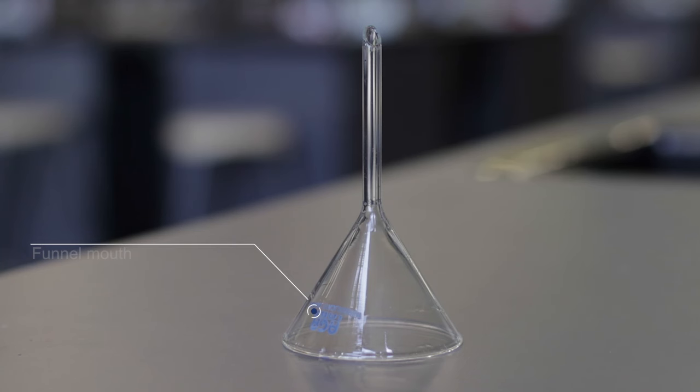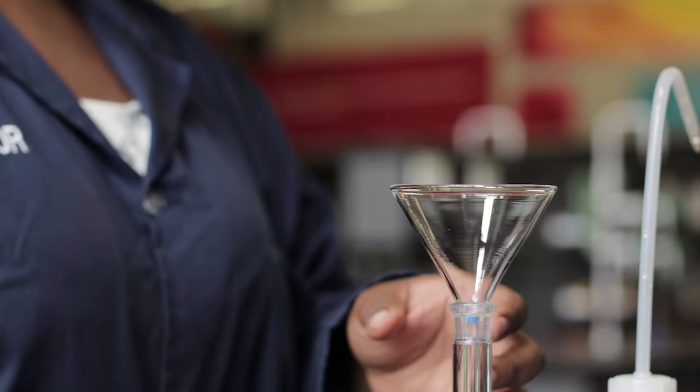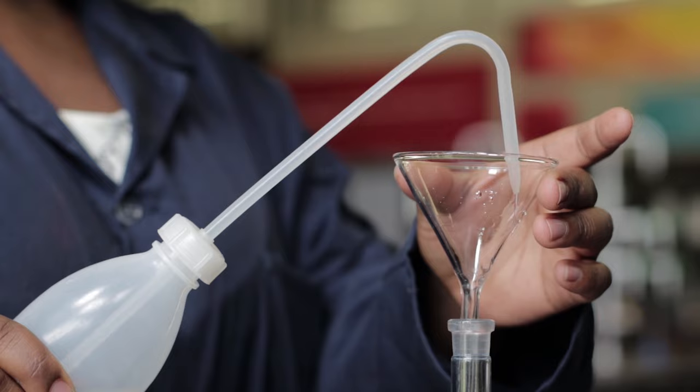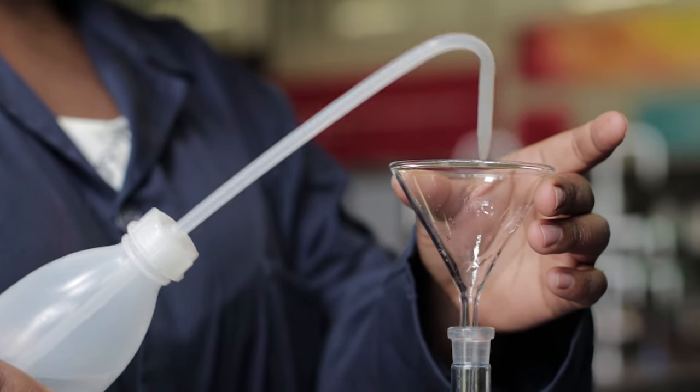A glass funnel has a wide mouth and narrow stem. A glass funnel is used when a solution or a solid needs to be added to a flask or a burette without spilling.